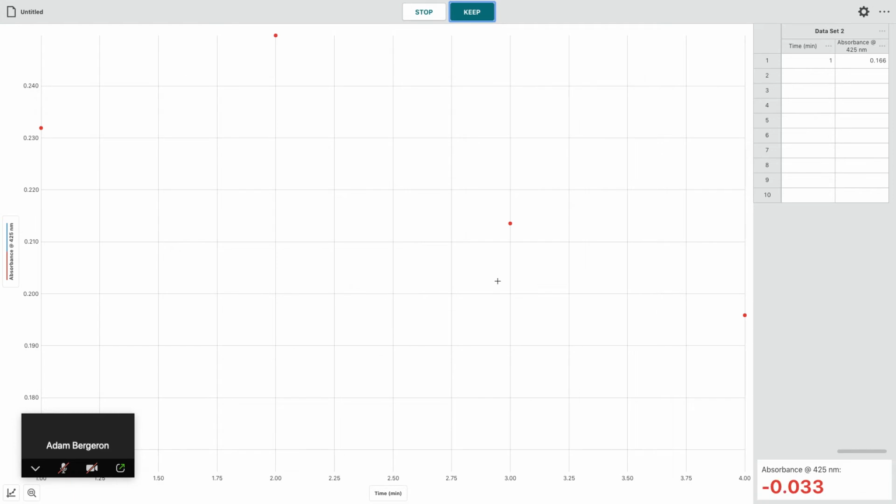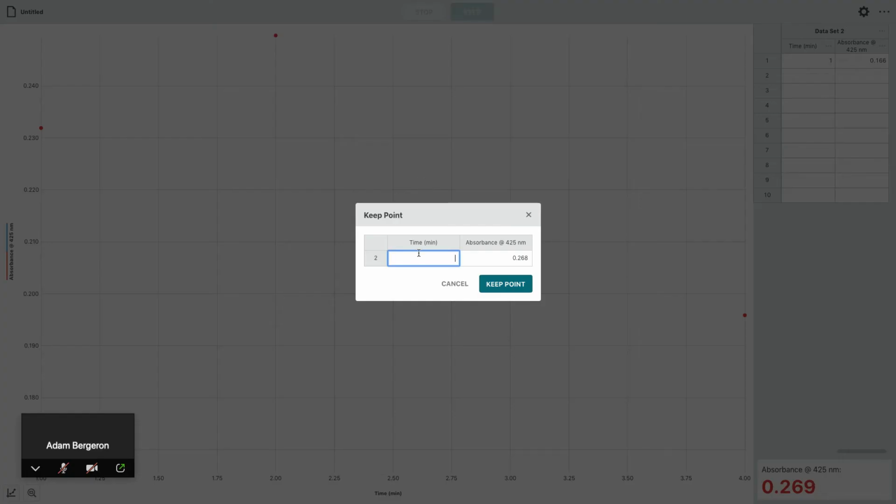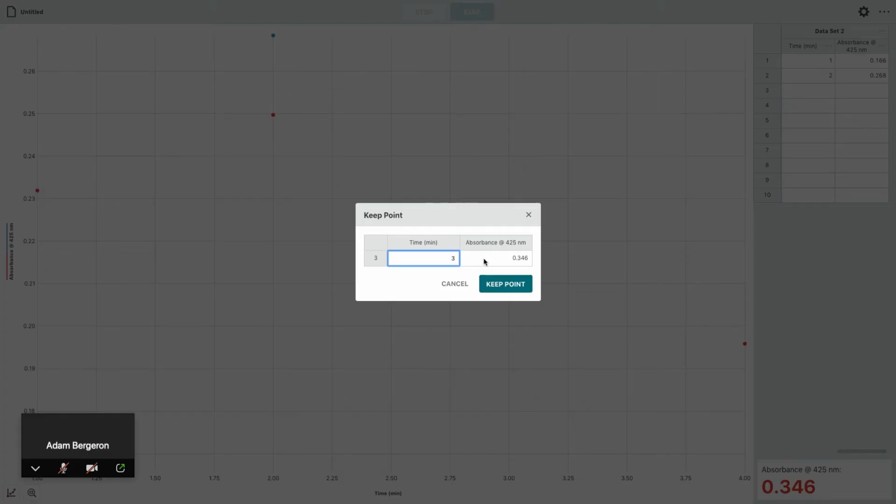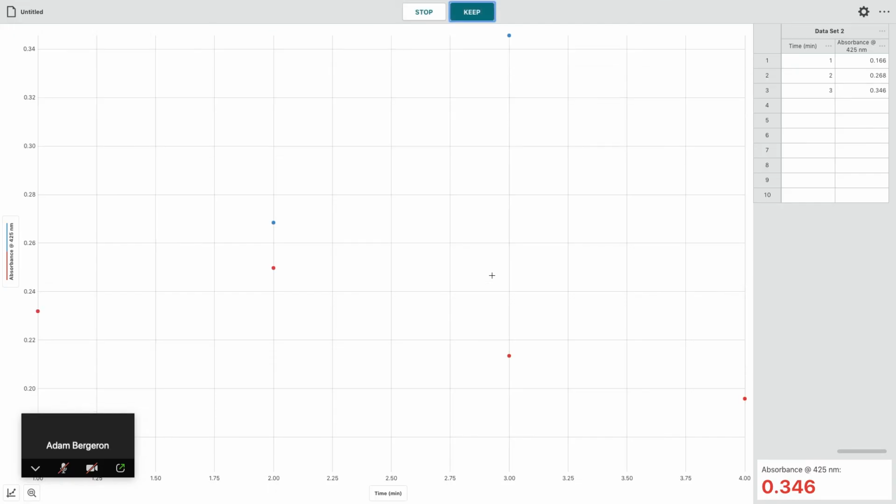Here comes 2 minutes. And 3 minutes. And finally, 4 minutes.